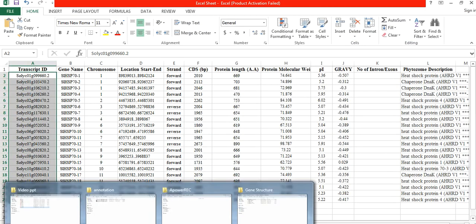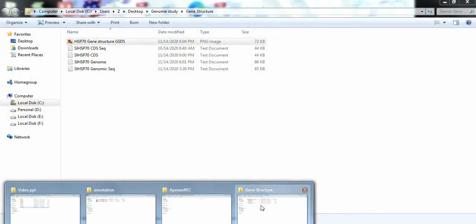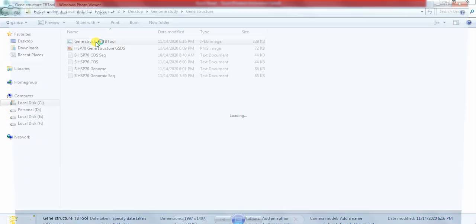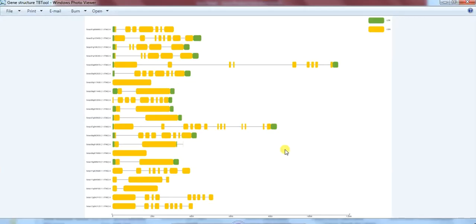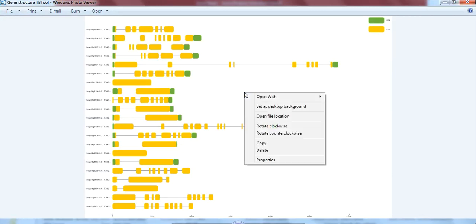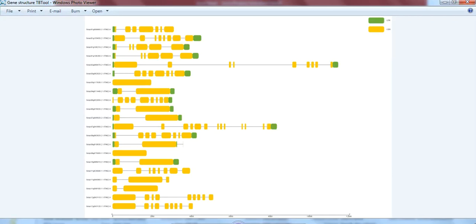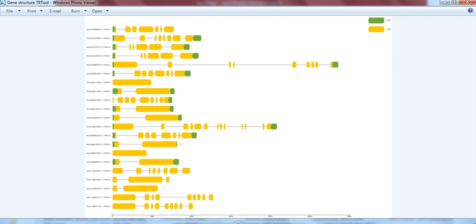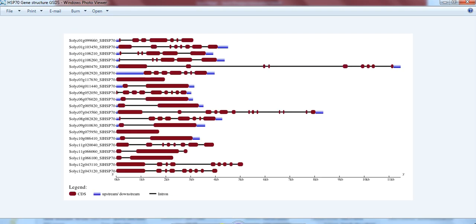Open that folder and check it. So you can copy this one or the previous one, this one that we have prepared online through Gene Structure Display Server, or this one that we have prepared through TB Tool, and use it into your manuscript which one you like.